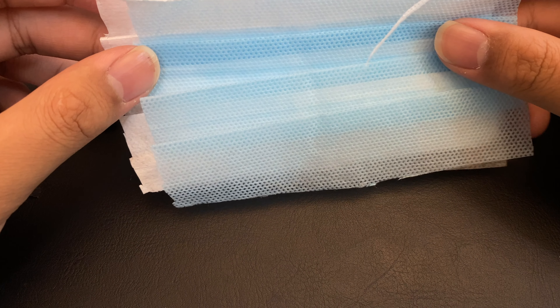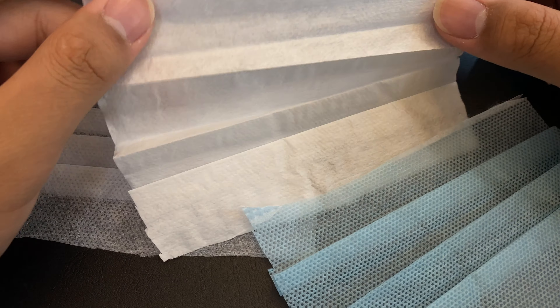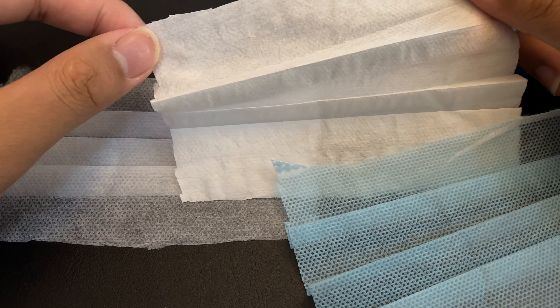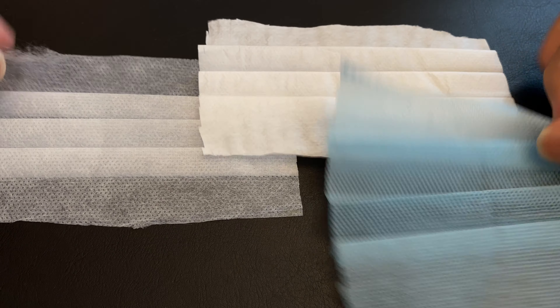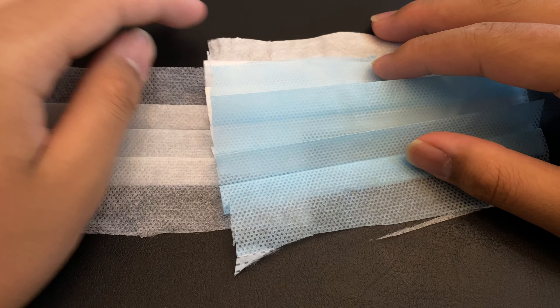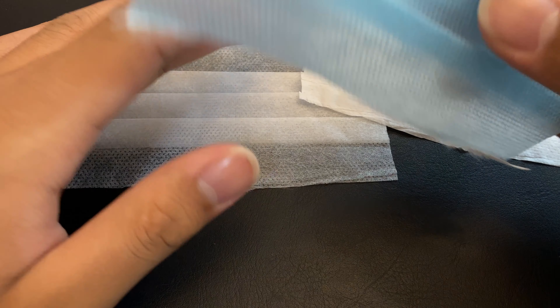I've just cut open the three layers of the mask. This is the first layer, this is the second layer, and that's the third layer. As you can see, the second layer is a bit more opaque and white. The fibers are smaller than the other two. They are all waterproof, so now I'm going to put them on a microscope slide and observe them under the microscope.